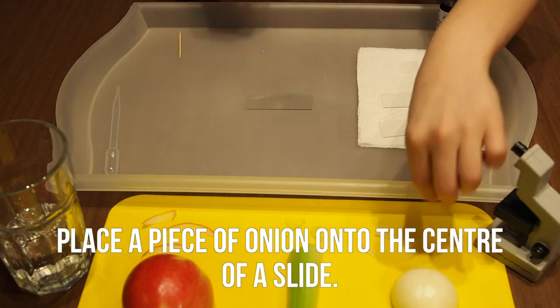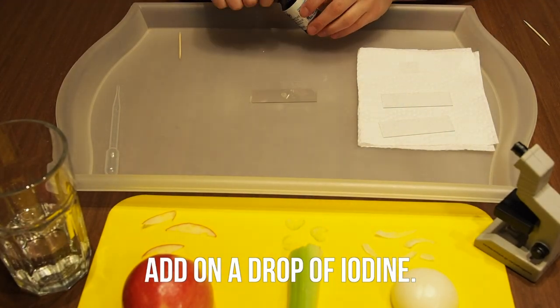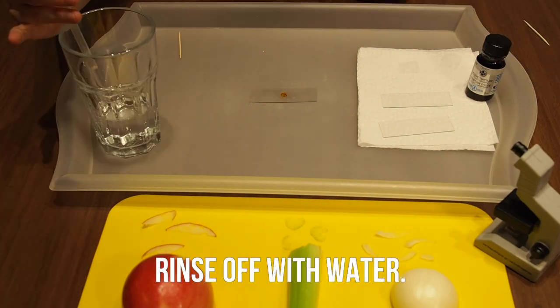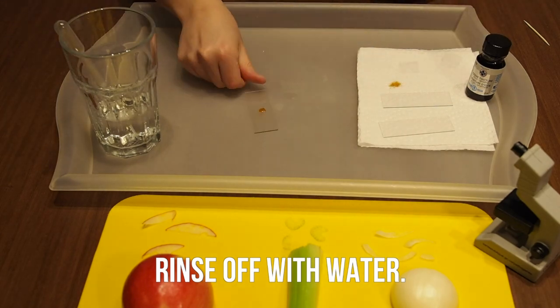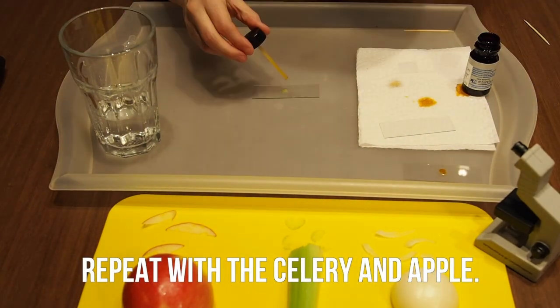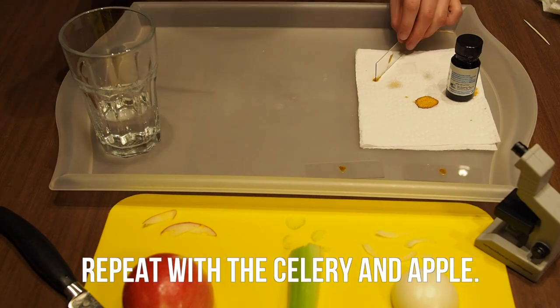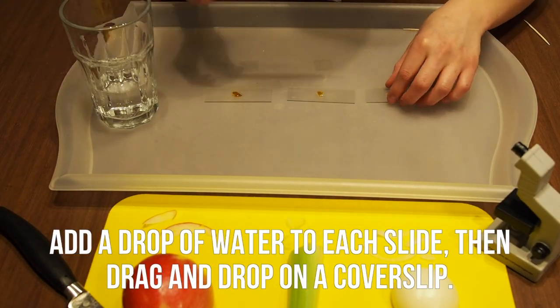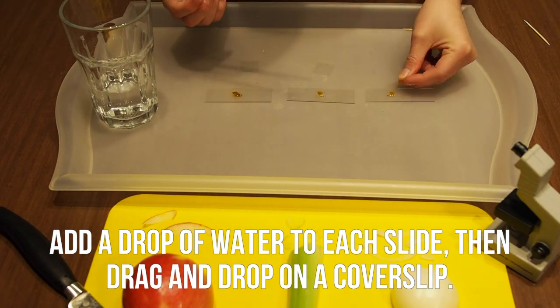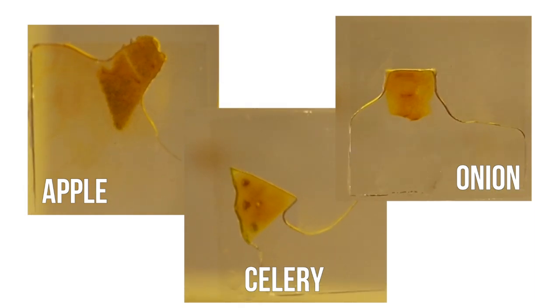Next, place a piece of onion onto the center of a slide. Then add a drop of iodine on top. Pipette water onto the slide to rinse it off. Repeat this process with the celery and the apple. Add a drop of water onto each slide, then drag and drop on a cover slip. Here are my finished slides.